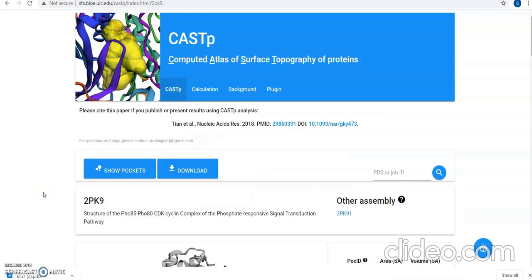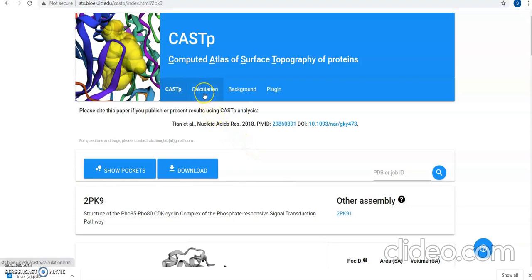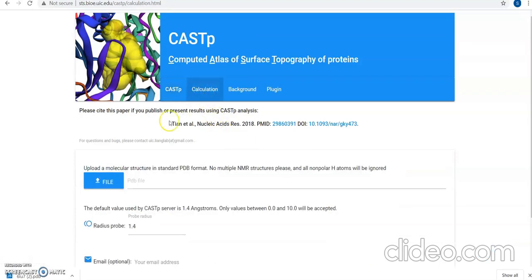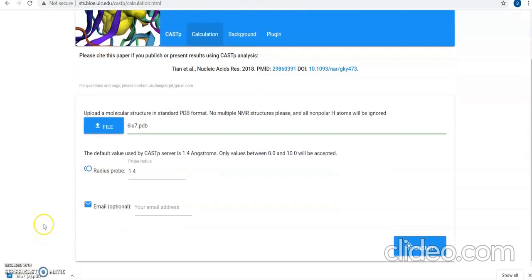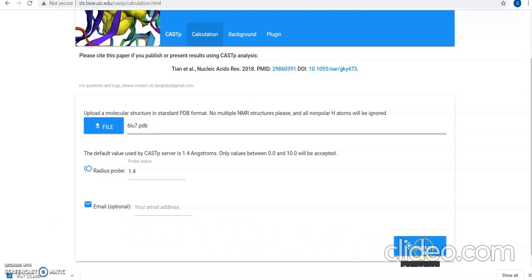Here at CastP, you can either enter the PDB ID or even upload. We'll upload the PDB structure by going to calculation and upload it from here. After uploading, you need not change anything. As you can see, the radius probe is 1.4 angstroms by default. You keep it same and click on submit.